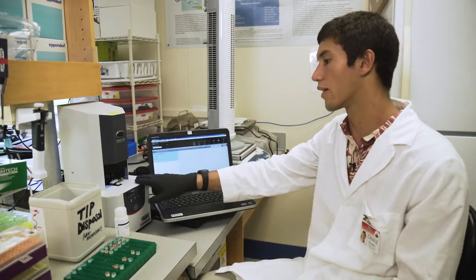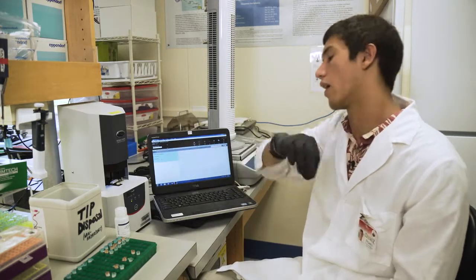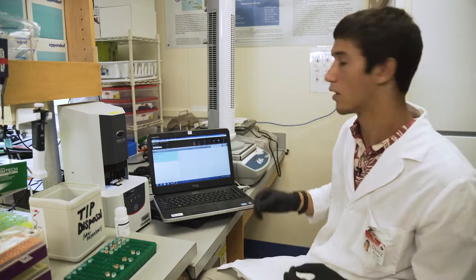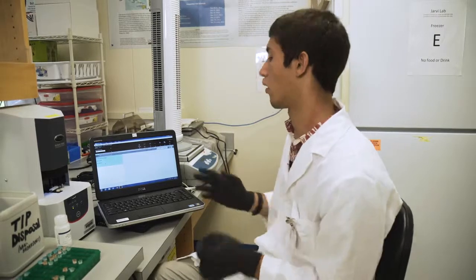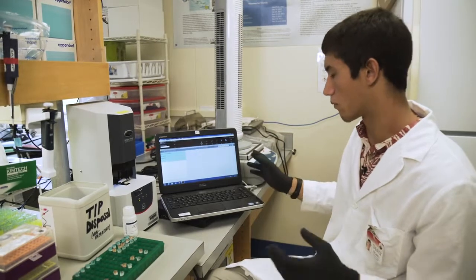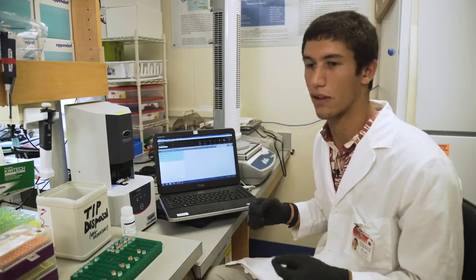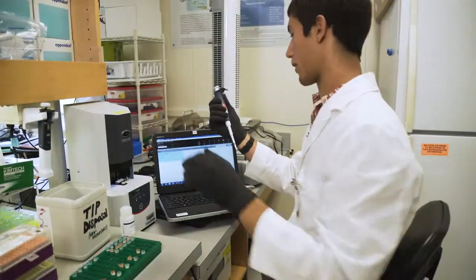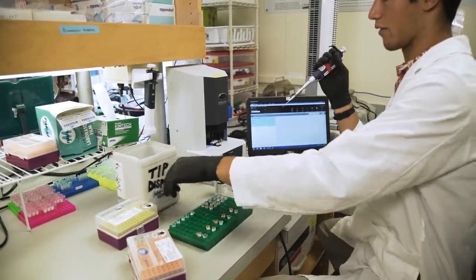What this machine does is it shines light through the sample that we put onto this tiny dot here, and it lets us know how much of the light made it through. Knowing that, we can have a pretty good idea of how much DNA is in that sample. It also gives us a nice graph of how much light made it through and at what frequency. So we can also see if there's contaminants or leftover salt in the DNA. The amount of liquid we put on this is 3 microliters, which is a very, very small amount.